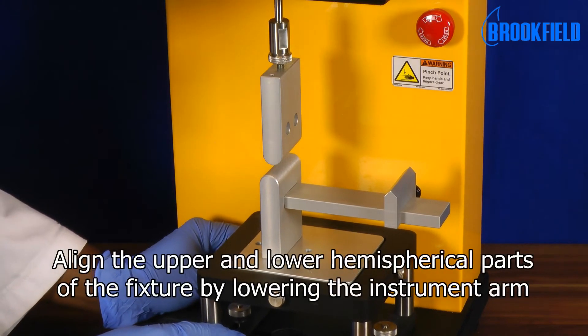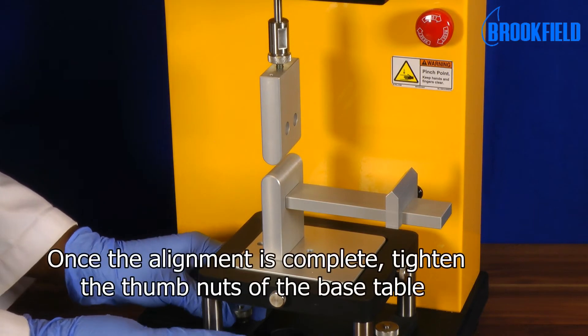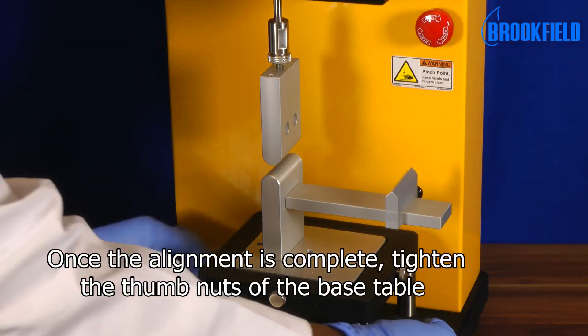Align the upper and lower hemispherical parts of the fixture. Once the alignment is complete, tighten the thumb nuts of the base table.